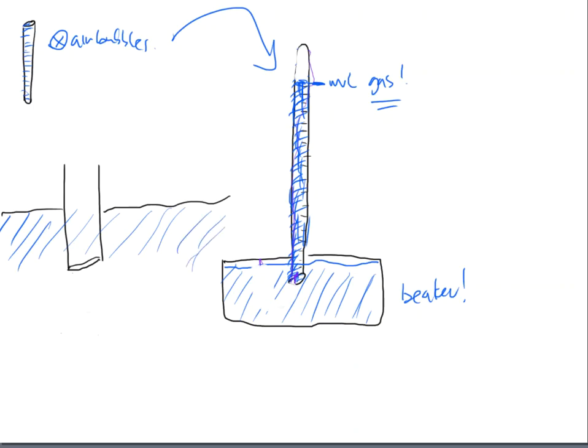All right. So what we've decided to do for the labs, and it works out great, don't feel weird about it, is that we take our solid. In the example that we did, it was zinc, right? So we'll take a chunk of zinc in that case, and we tie it using a piece of thread. And that thread is going to be attached to the sides of the eudiometer with a little piece of tape. That's all that we've got to do. So we're actually eliminating the flask or beaker. We're eliminating the piece of glassware that has to be bent in order to get there.